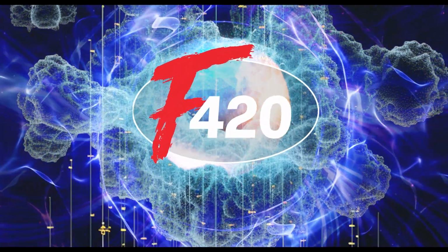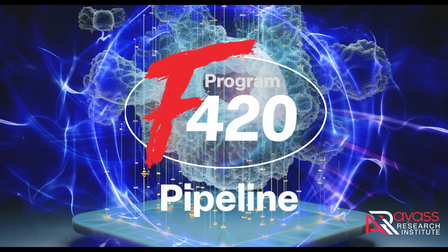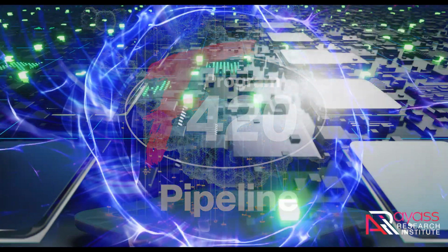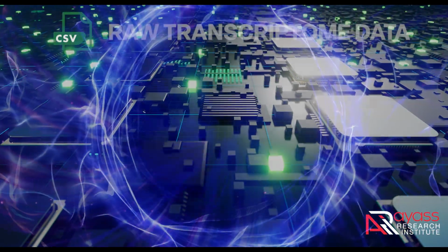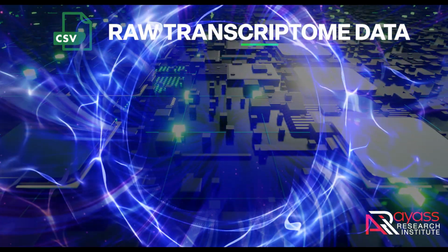In this video, we will explore the F420 program pipeline at Ayass Research Institute. The F420 software takes a CSV file as input and in a matter of seconds produces a customized report.